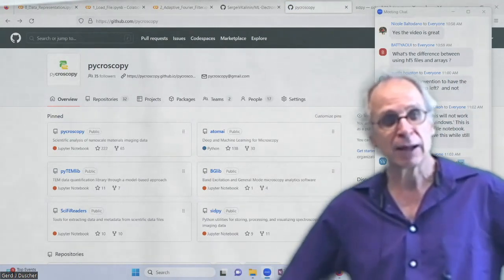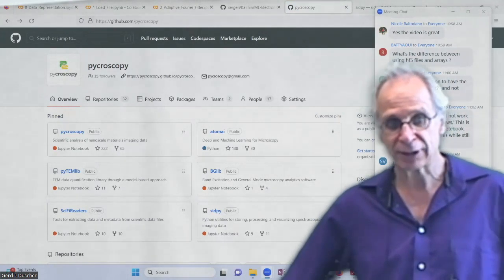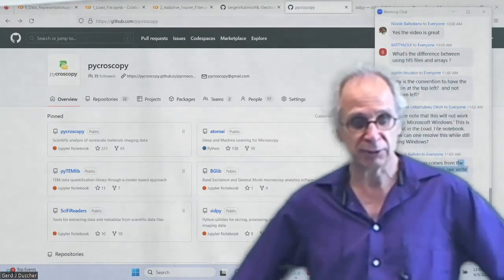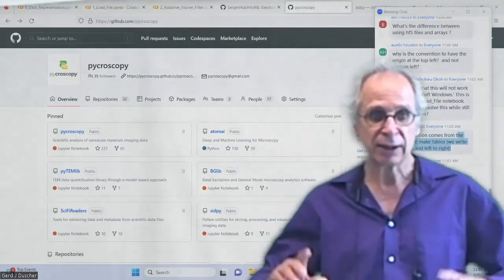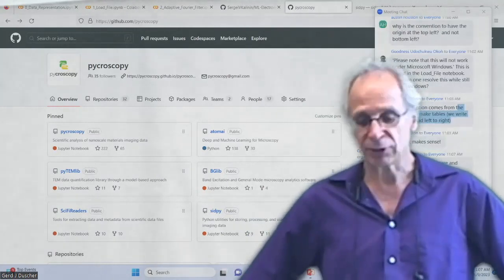So I'll see you all on Tuesday, where we do EELS, electron energy loss spectroscopy, low loss and core loss, quantitatively. That's the key. And again, remember all your different settings.